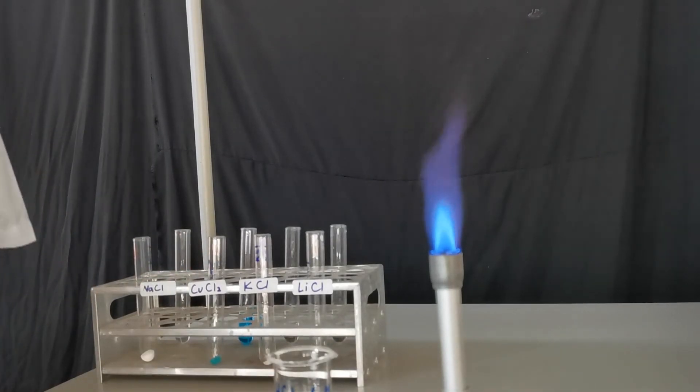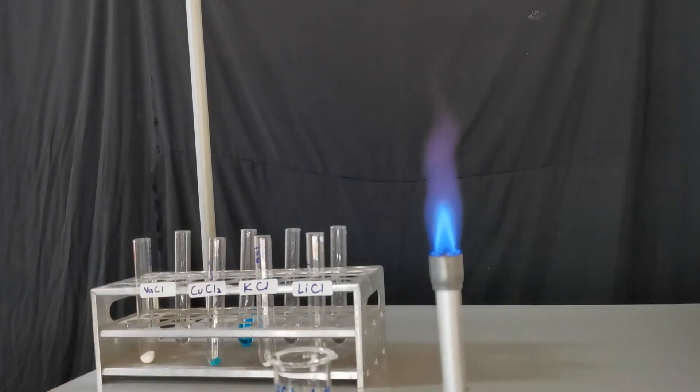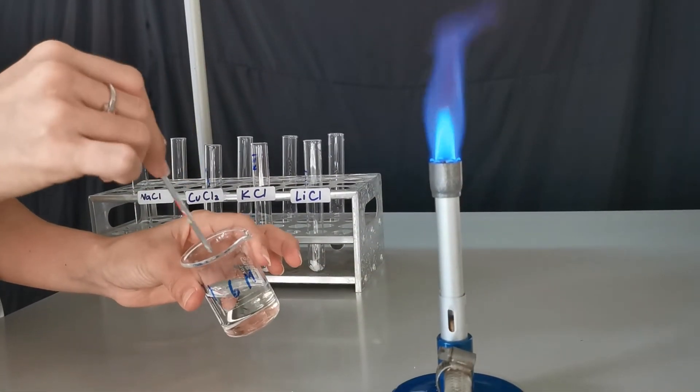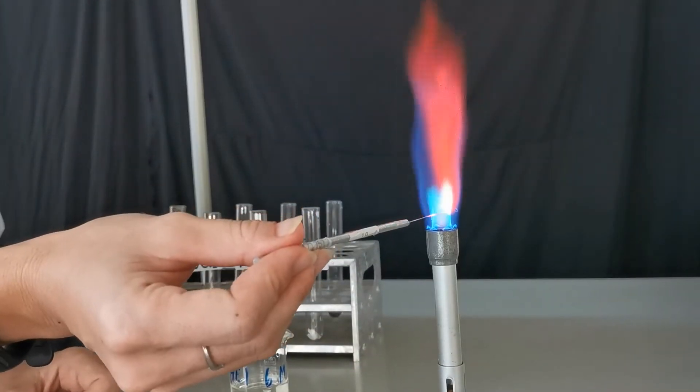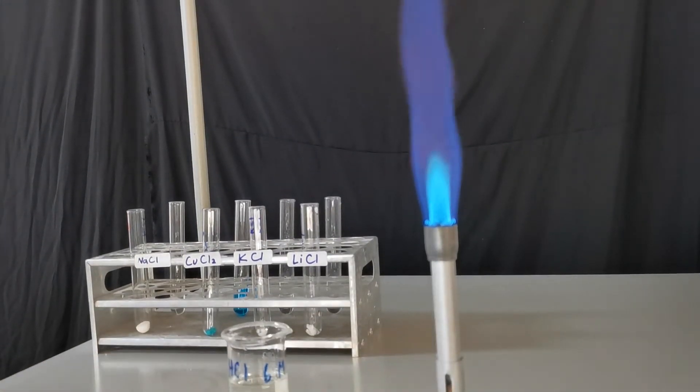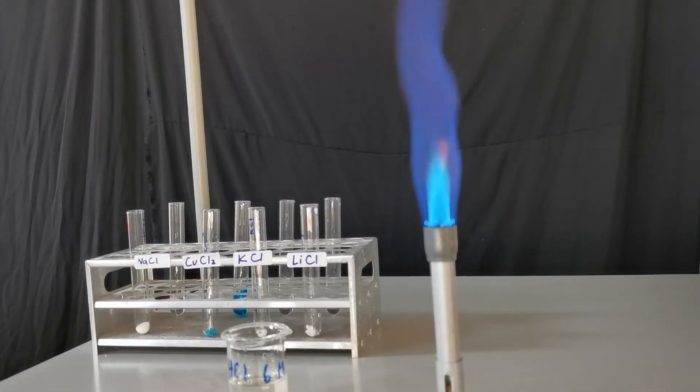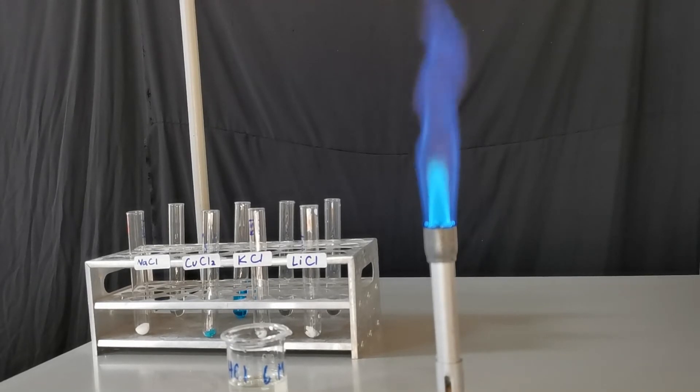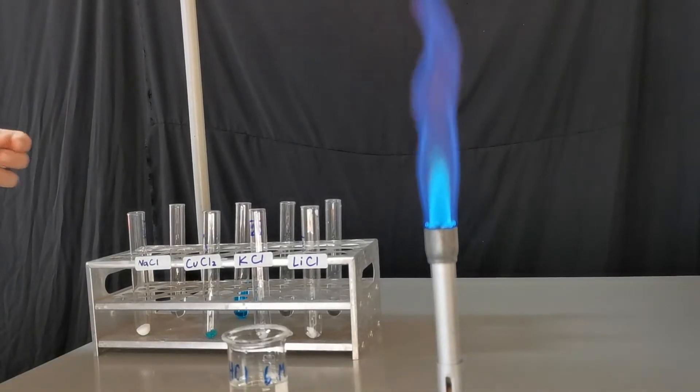Now we're going to wash the loop again. The second test that we will do is copper chloride test, so we are testing the flame color of copper ion.